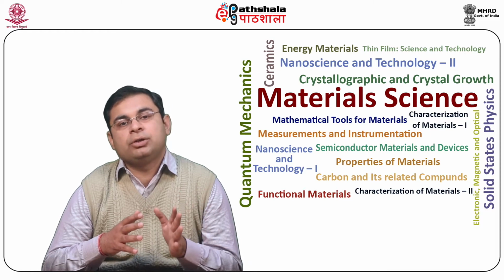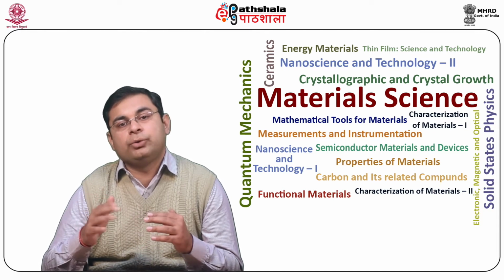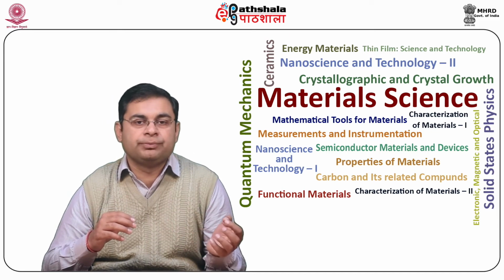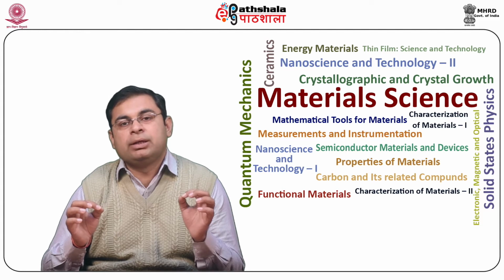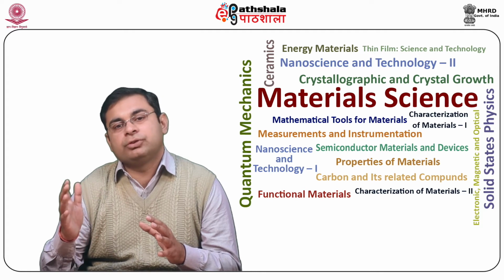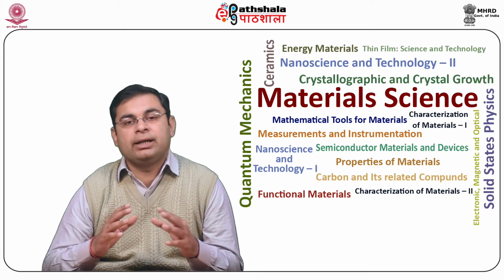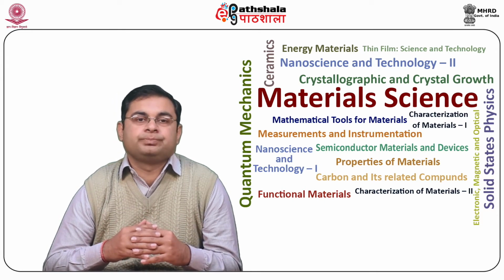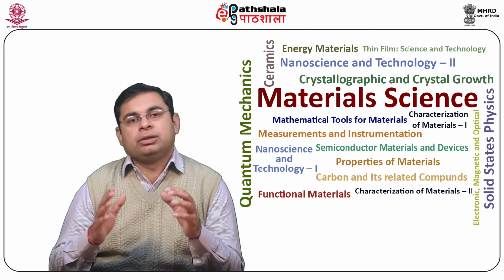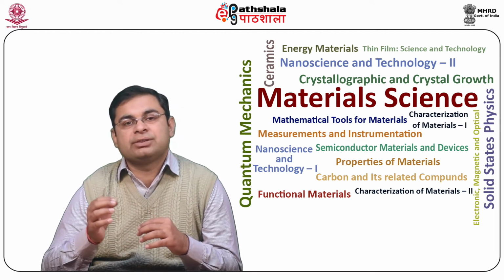Auger is a 3-electron process, wherein an electron beam having 1 to 10 kilo electron volt energy is bombarded onto a solid surface. Impact of the beam ejects an electron from the inner or core shell of surface atoms, thereby creating an ionized excited atom. An electron from an outer shell can occupy the vacancy produced in the core shell via a non-radiative transition.